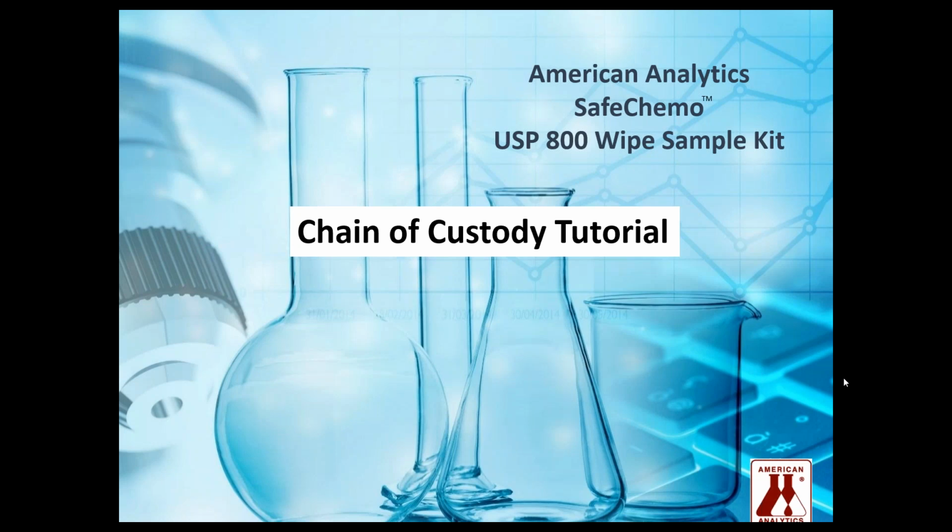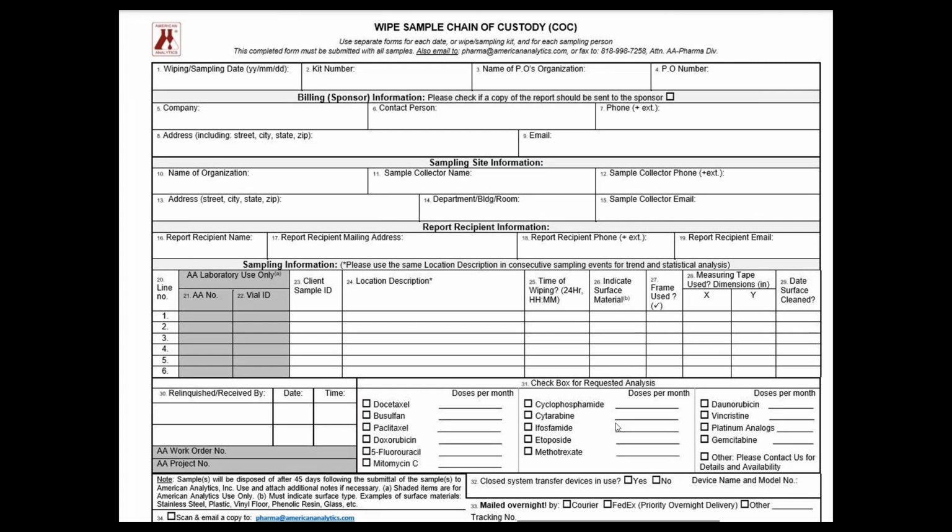And the chain of custody form is a very important form that's a part of every single kit. And it's really important for you to fill it out properly because it actually is a legal document for your sampling event. And this is a copy of our current chain of custody. You'll see at the top here it says Wipe Sample Chain of Custody, COC. And there's a lot of instructions, so it can be a little overwhelming, and so that's why we decided to create this video to go through step-by-step in detail on how to properly fill out this form.